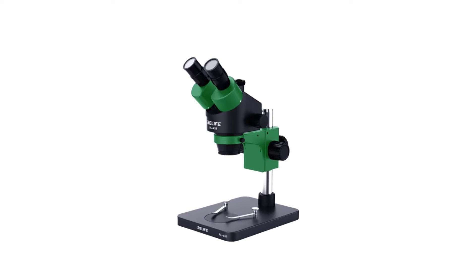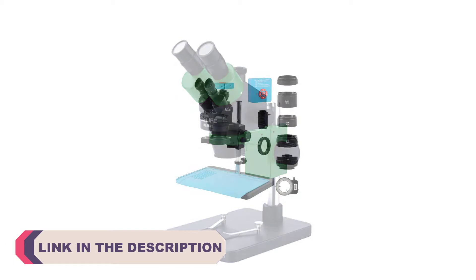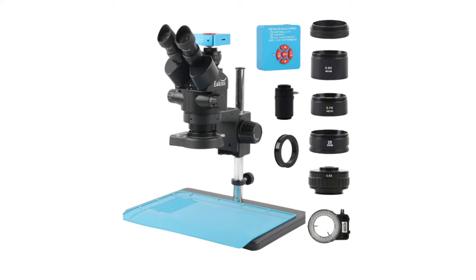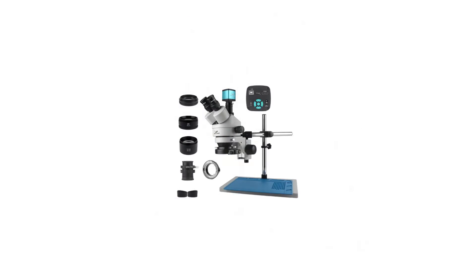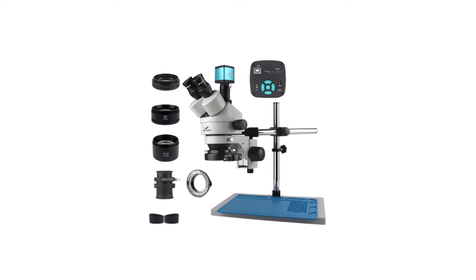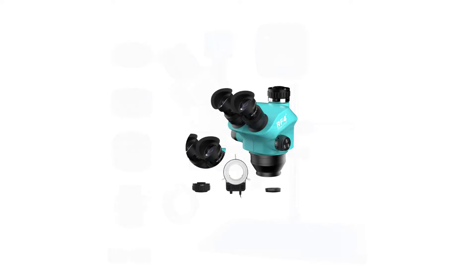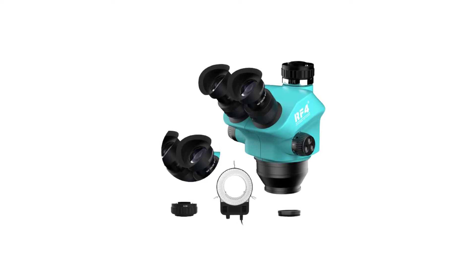When it comes to observing the intricate details of specimens, whether in a laboratory, educational setting, or for various industrial applications, a trinocular stereo microscope is an indispensable tool. These sophisticated instruments combine the power of stereo vision with the convenience of a trinocular head, allowing users to capture images or video while simultaneously examining their subjects in three dimensions. To help you navigate the world of trinocular stereo microscopes, we've compiled a list of the top 5 best options available in the market.